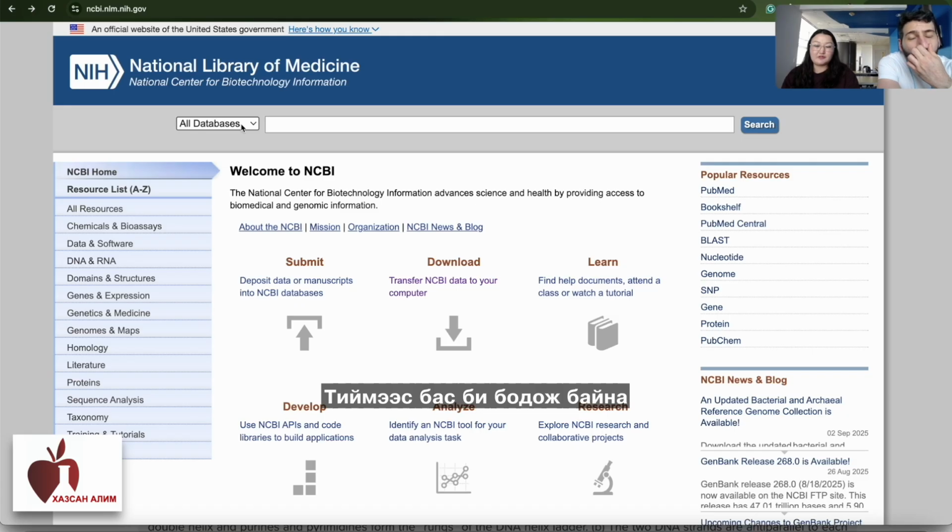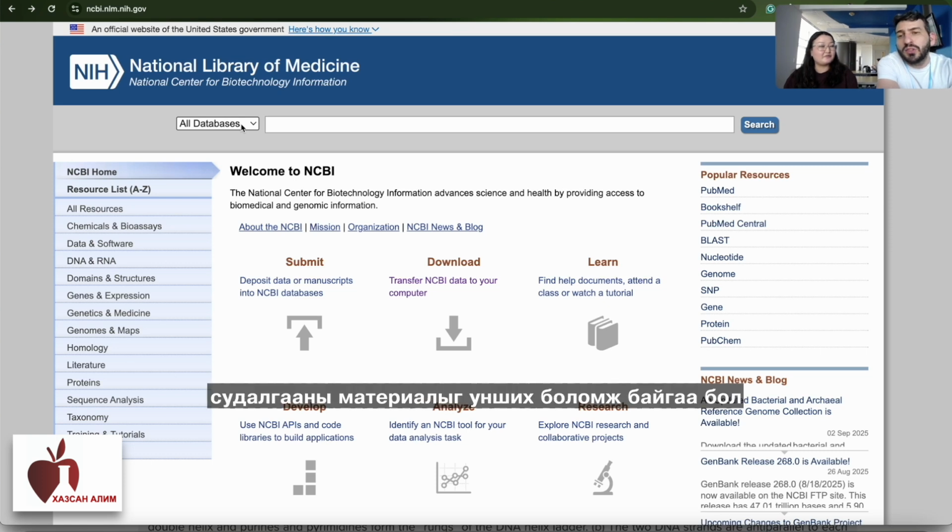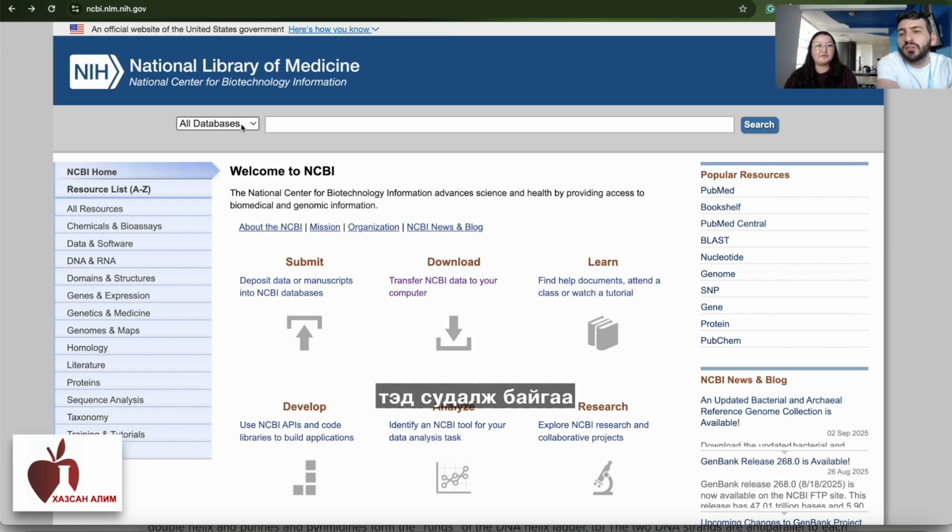Yeah. Also, I think it's very important to mention that I always like to design my own primers to check the whole process, to check all the sequence. But there are a lot of papers that have already reported different primers. So if you have the opportunity to read a paper studying a gene that you are studying at this moment, they reported the primers for some reason, so you can use them, and that's easy. But I recommend doing this exercise of creating your own primers from the beginning.